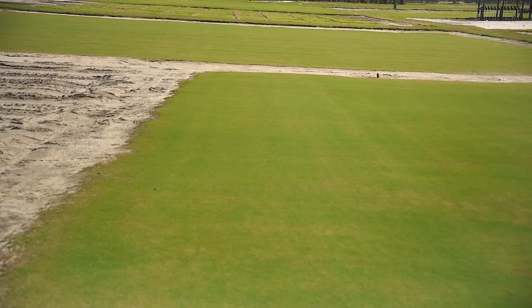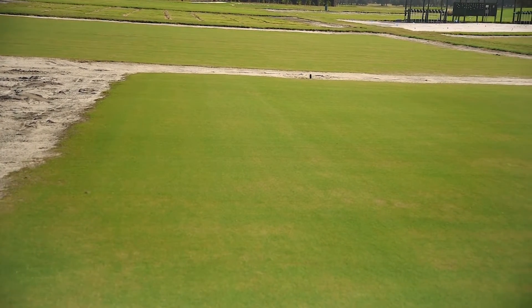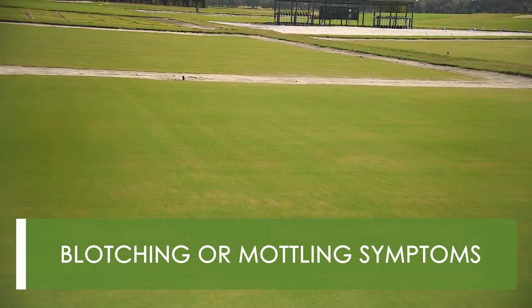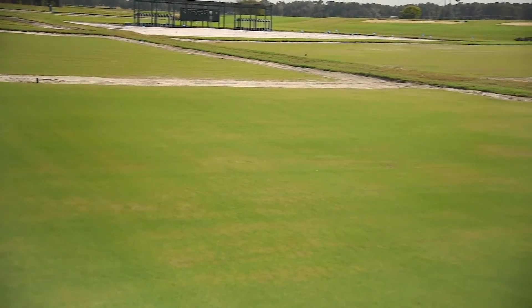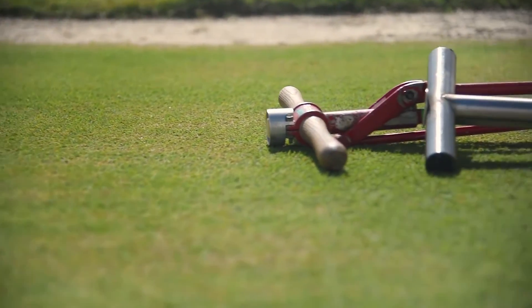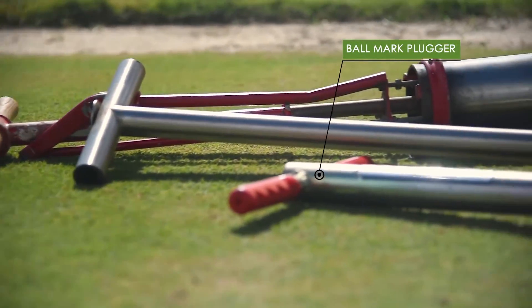The characteristic symptom we've found associated with these root knot nematodes on putting greens is this blotching or mottling type symptom like you're seeing here. So what I'm going to do is take my ball mark plugger and take four turf plugs from these symptomatic areas to use for my sample.